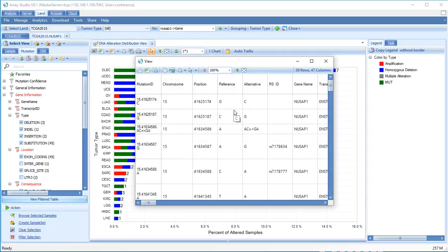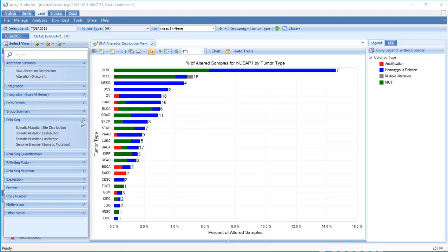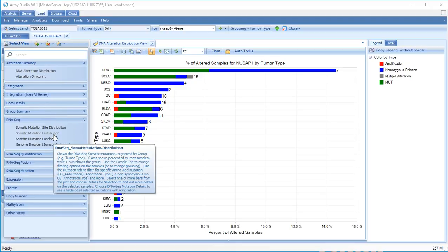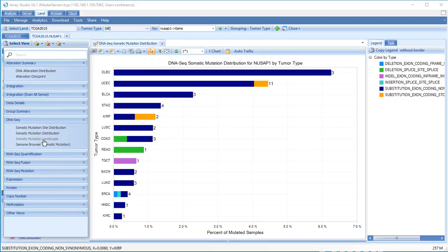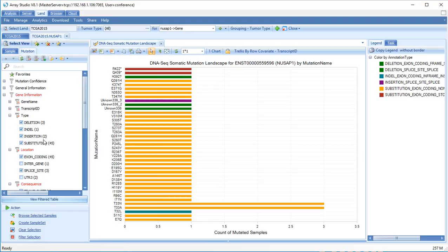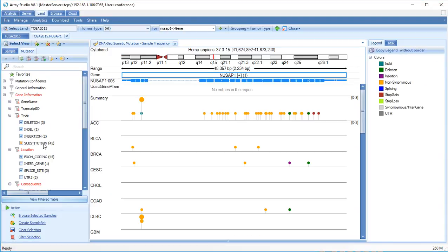There are many other views available for gene-level data. For DNA-seq data, the somatic mutation distribution view shows the frequency of different types of mutations within NUSAP1 grouped by tumor type. The somatic mutation landscape view shows where along the gene mutations are found. The genome browser view also displays where mutations are found along NUSAP1 grouped by tumor.